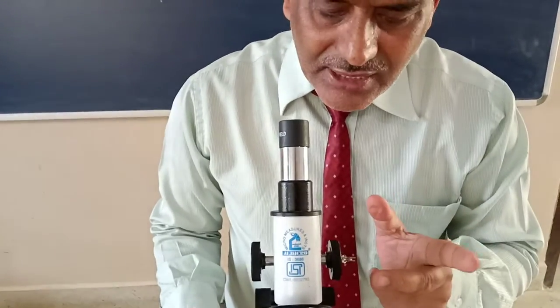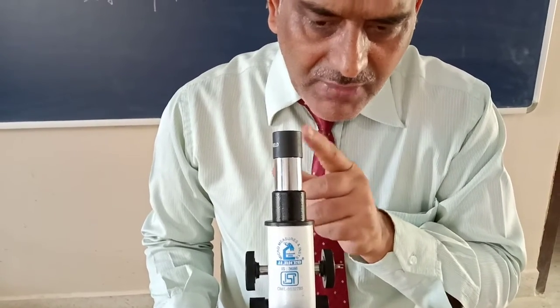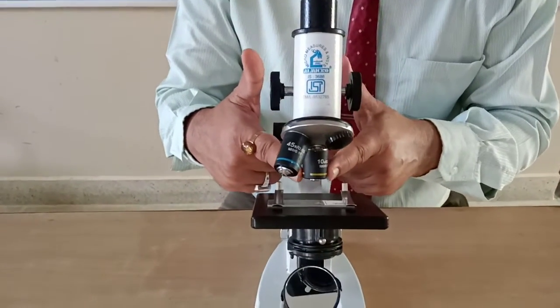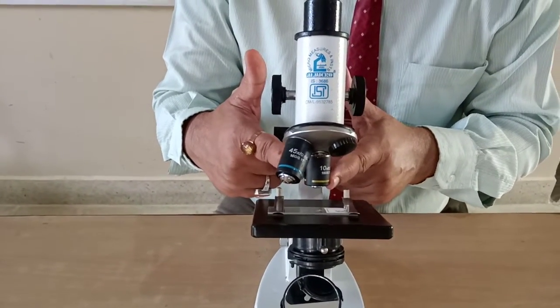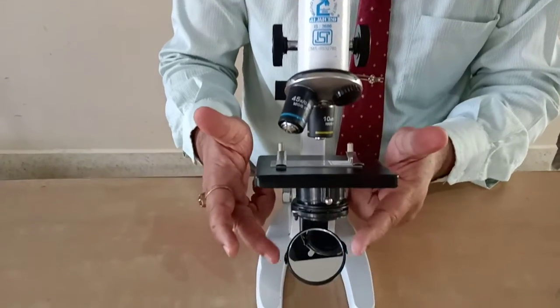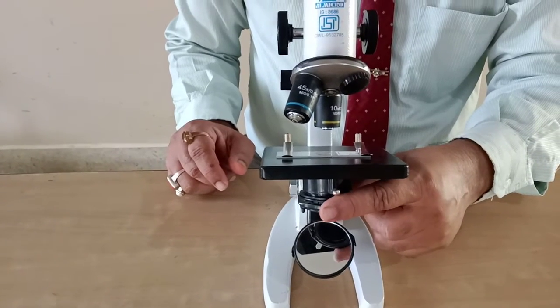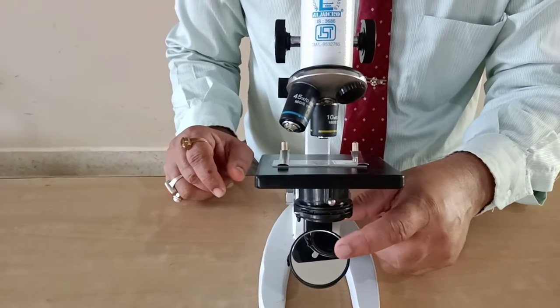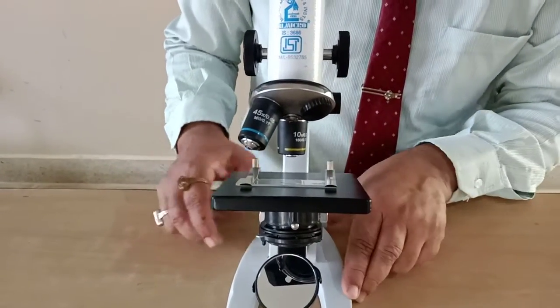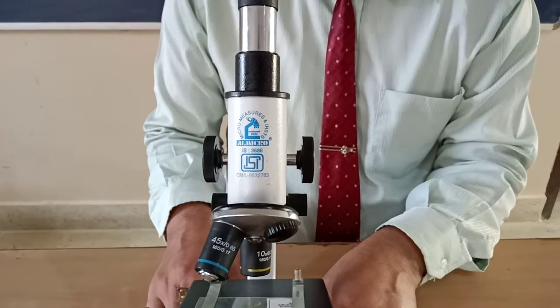Two main lenses for viewing: the eyepiece, for viewing by us, and the objective, which lies above the object or the slide. And the diaphragm also has a lens which can adjust the light rays. So these are the parts of the compound microscope.